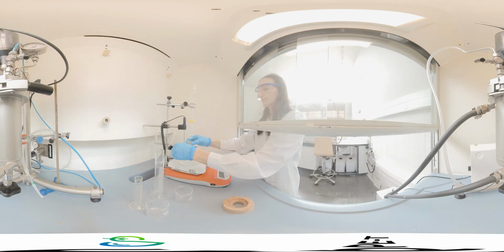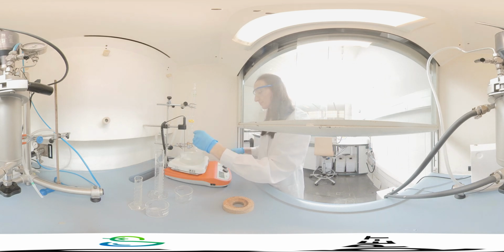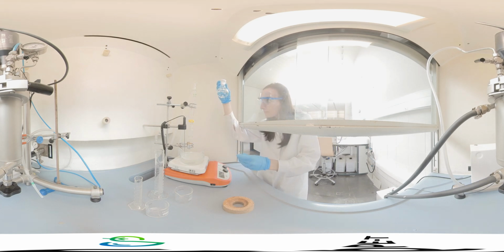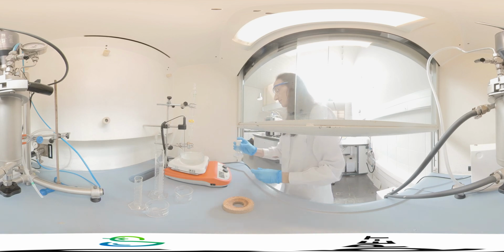Once the reaction is finished, 2-chloroethanol is extracted from the aqueous phase and purified by distillation to remove volatile compounds. After characterization by gas chromatography, the product is ready to use in the next step.